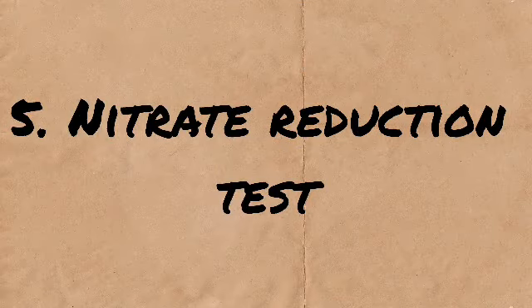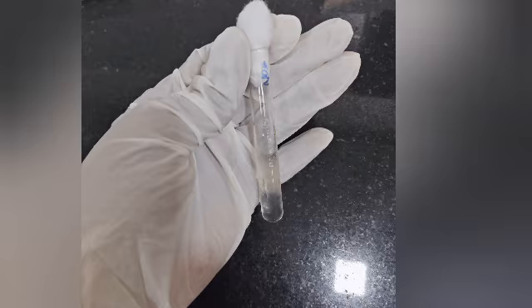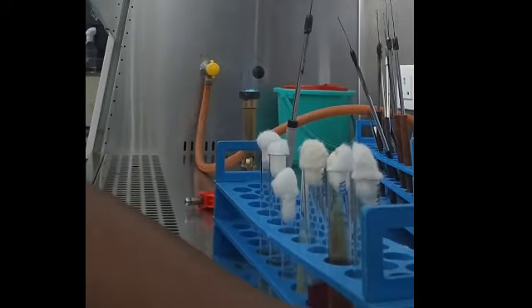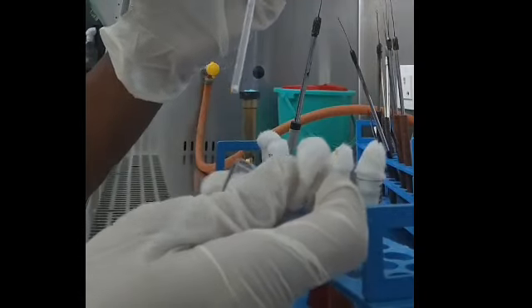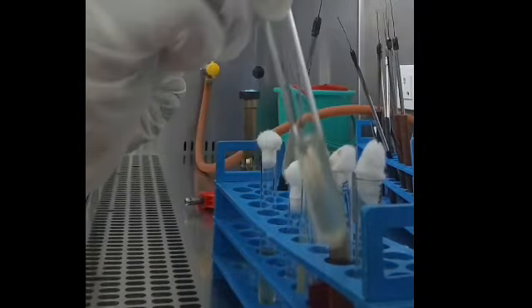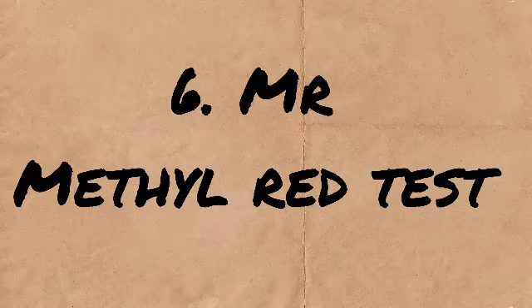Moving forward to the next biochemical test, that is the nitrate reduction test. This test detects the presence of nitrate and its conversion to nitrite. This test is performed by adding the bacterial suspension to the nitrate medium, and the tubes are allowed to incubate for 24 hours.